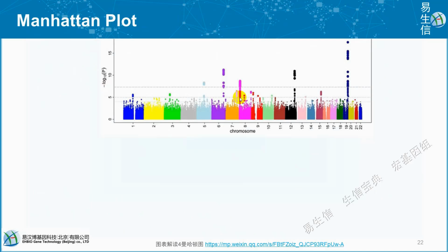So similarly for this Manhattan plot, you can do this, because a Manhattan plot is essentially a scatter plot used to display a large number of non-zero large scale fluctuation values. It was first used in genome-wide association analysis, GWAS studies, to display highly correlated sites. It gets its name from its resemblance to the Manhattan skyline.